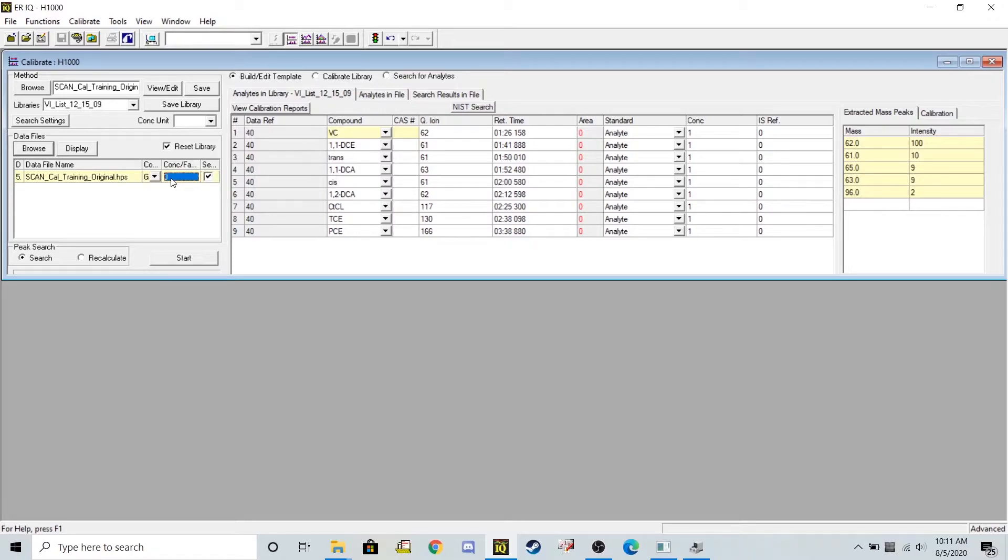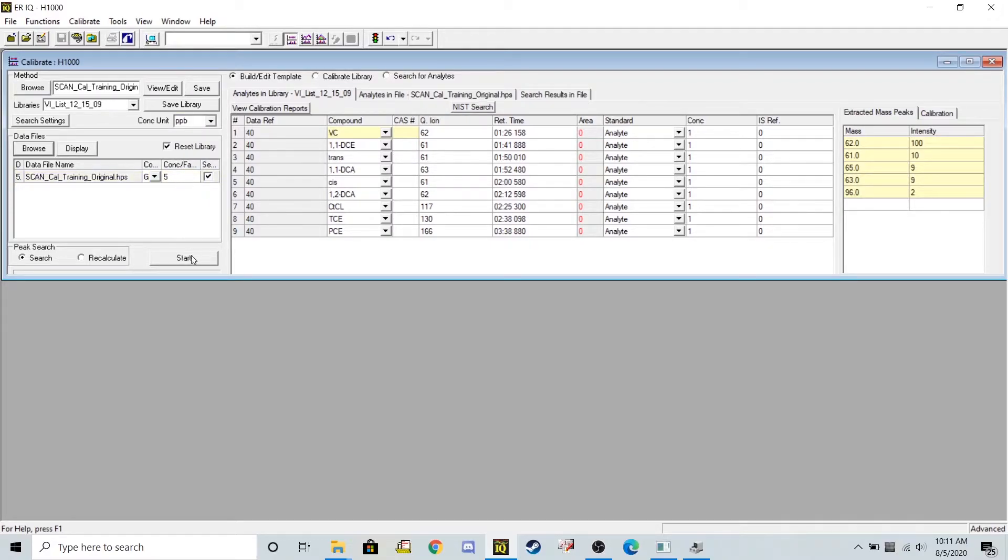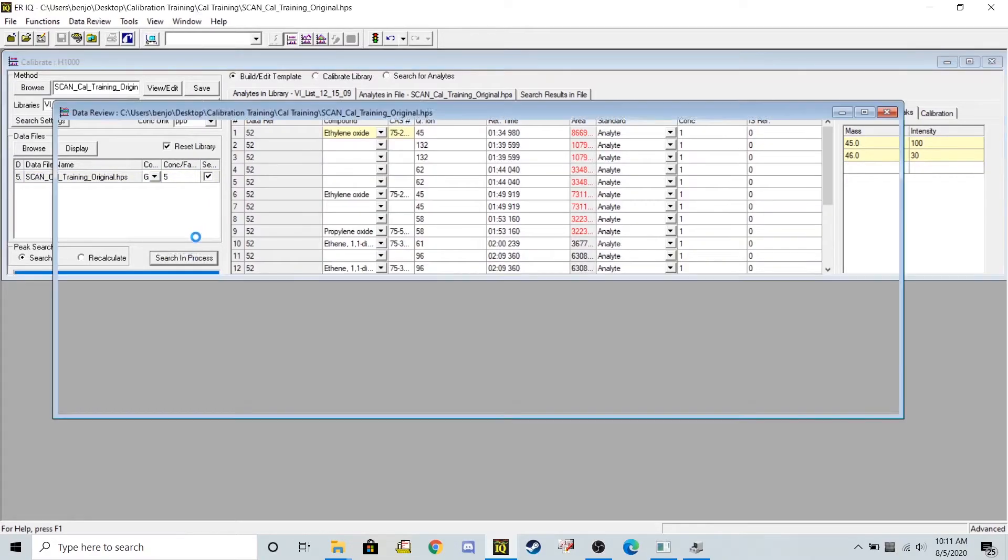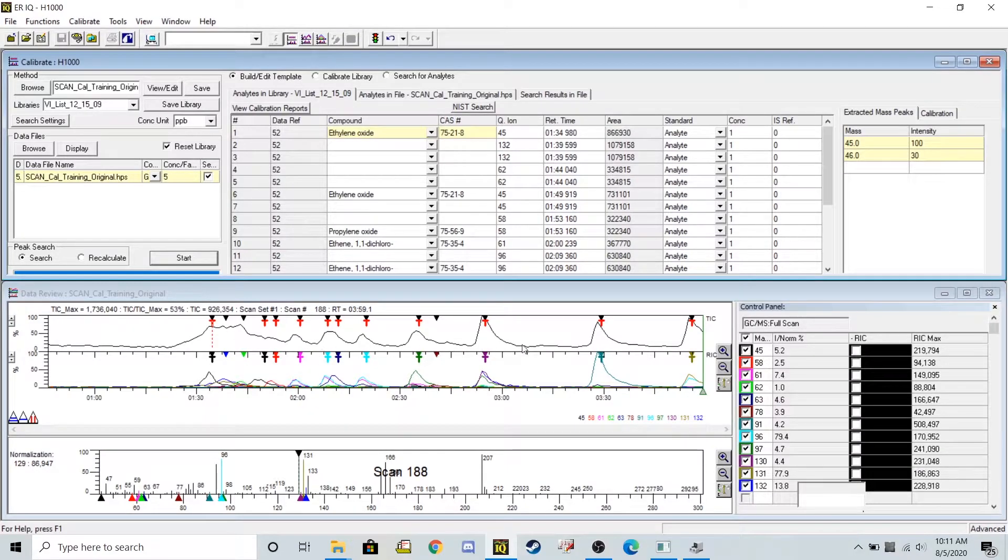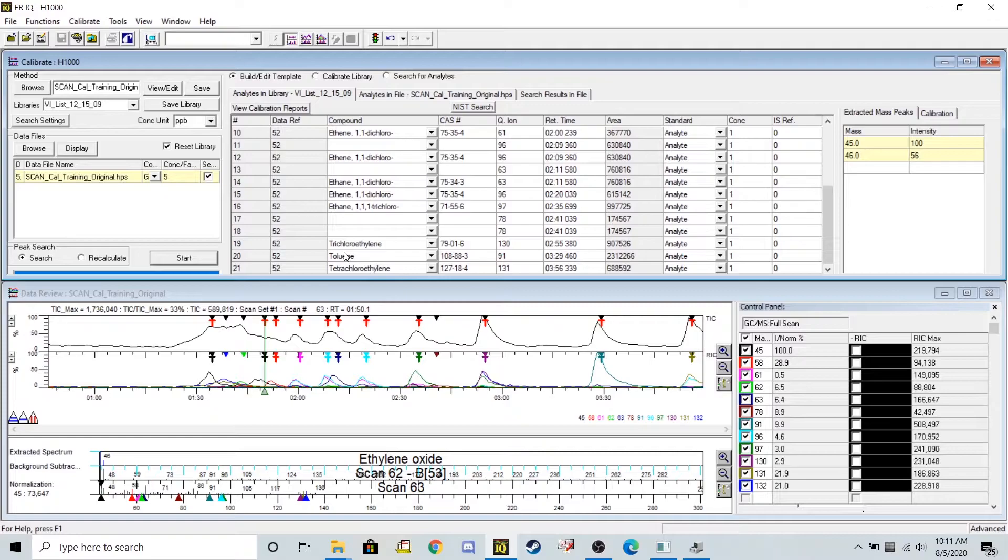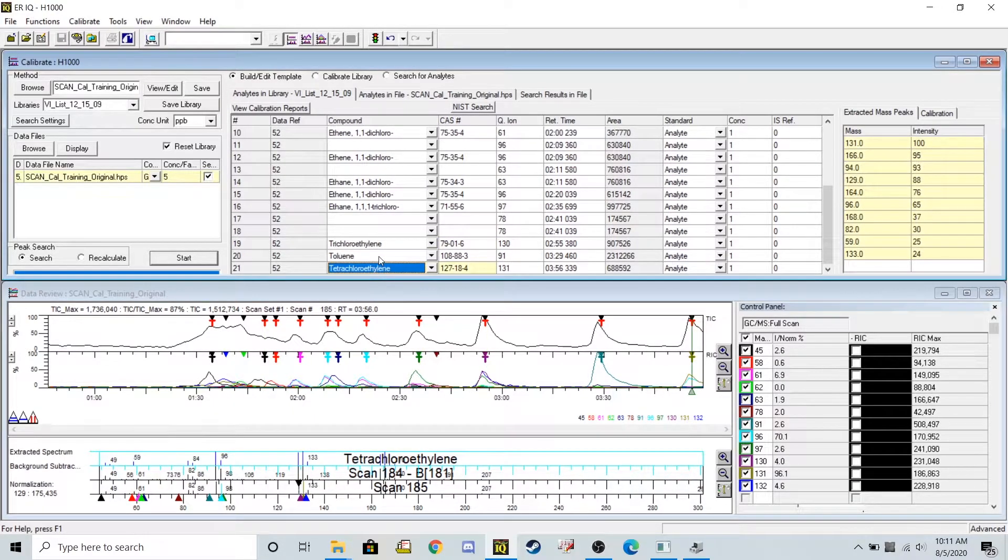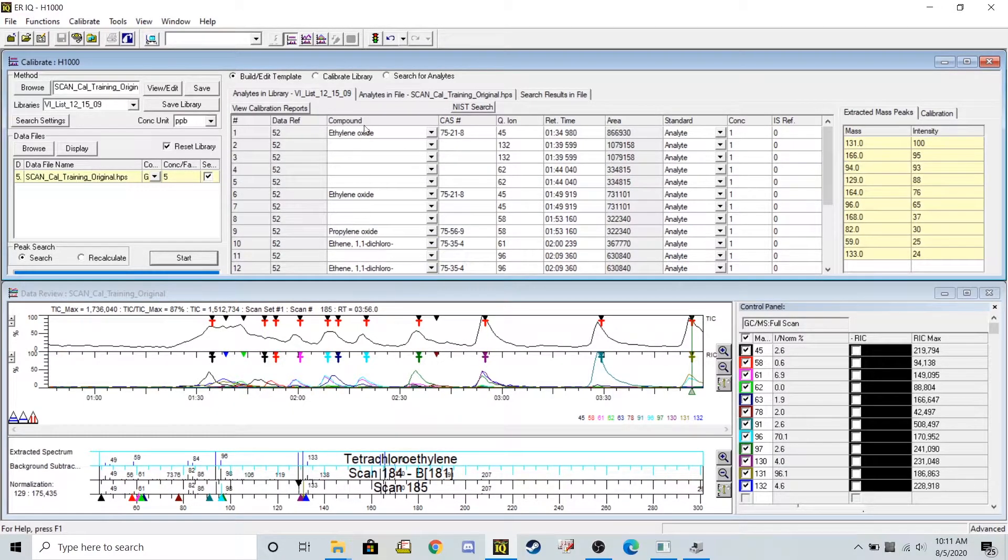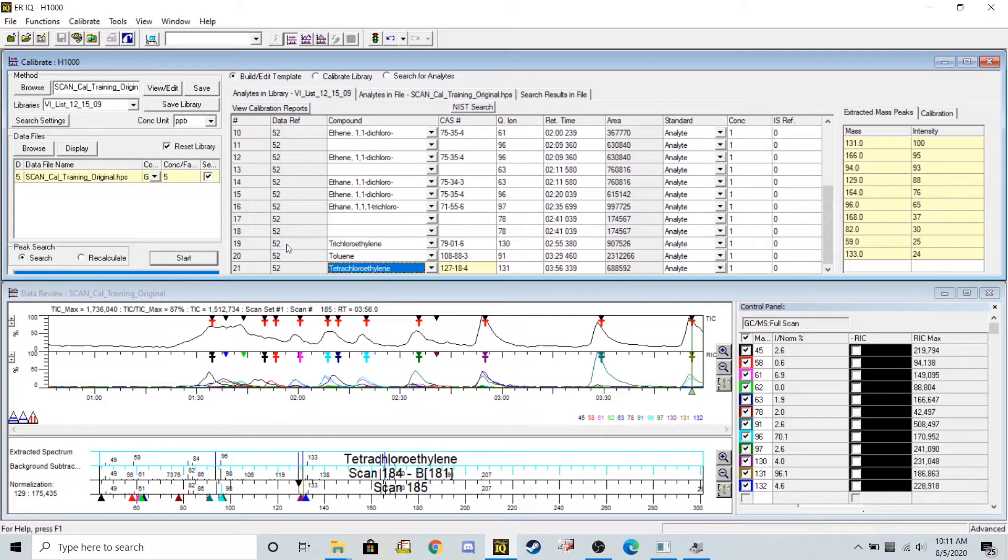Set my concentration to about five and my units to parts per billion. At this point I can click start and it should automatically integrate everything it sees in this data file. If in this example I just want to be able to see trichloroethylene and tetrachloroethylene, I can delete all the other things it attempted to integrate when I click start.